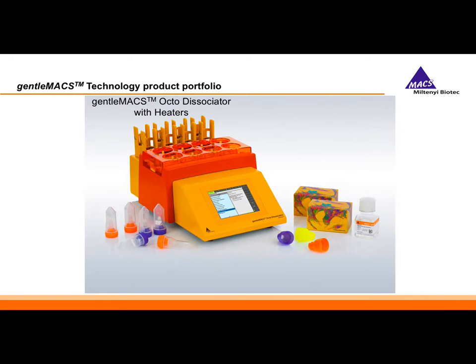It has 8 different positions where you can put the tubes for tissue dissociation, so it can hold 8 samples, and they all move independently, so you can process 8 different types of samples. You don't have to have 8 samples of one type. You could have liver, spleen, brain, anything on here. They all run independently. And then we have the heaters. The heaters go over the tubes and create a nice environment for the enzymes to work, because most of the time you need heat for enzymes.